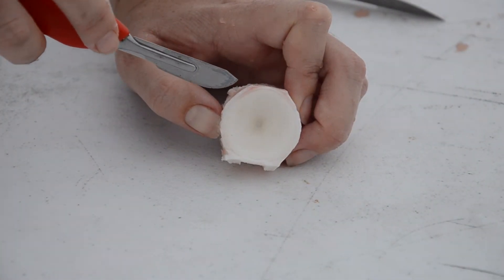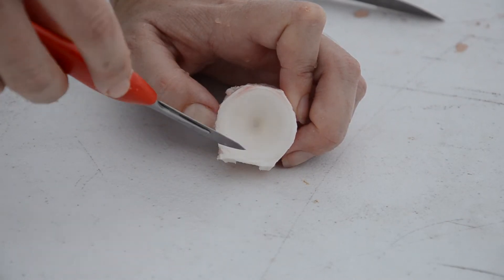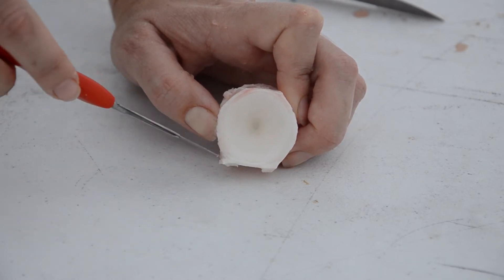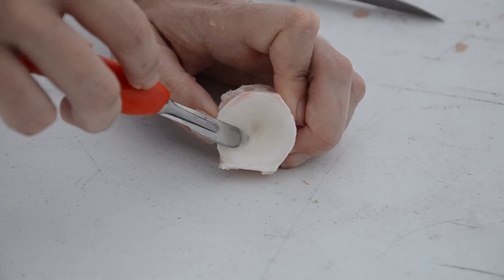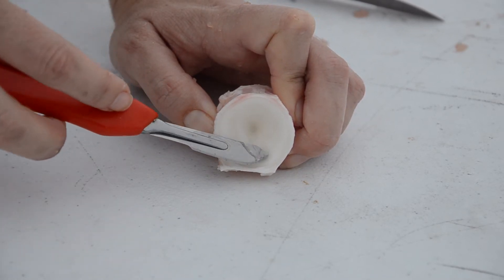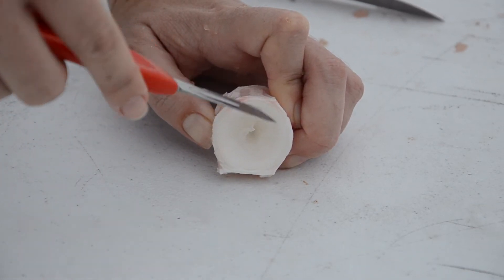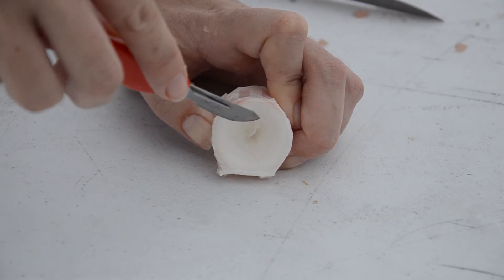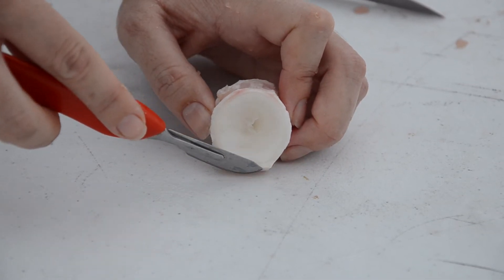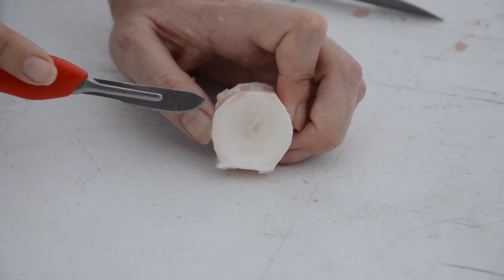Here we have a separated individual centra and now we're going to do a little bit more cleanup. It's not perfectly round so we're going to use a scalpel to remove a bit of this material. There's also jelly inside and we're going to use the scalpel to scrape that material out, being very careful of our fingers because scalpels are very sharp. We don't need to work too hard because bleach is going to do a lot of our work for us.